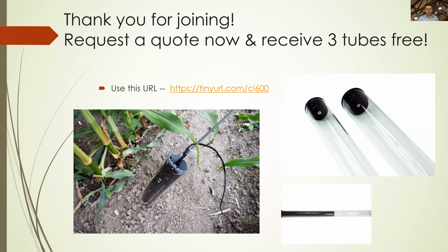The next question, it looks like, is how many times can one tube be used? The tube actually can be used for years on end. The most important part is that that tube just doesn't get scratched up and damaged, so you're not really getting a clear viewing of the surrounding root system. Using acrylic, we have found that has mitigated a lot of the problems of past different substances. But if you have rough ground, like when you're doing your installation, that's when you're going to be getting most of the damage done.